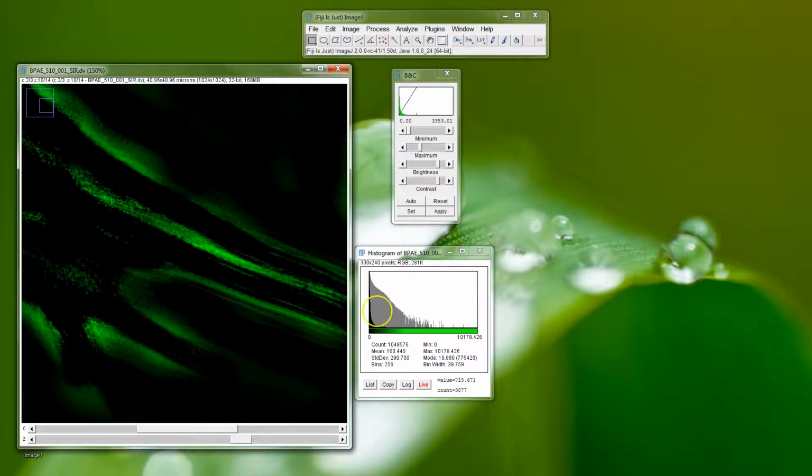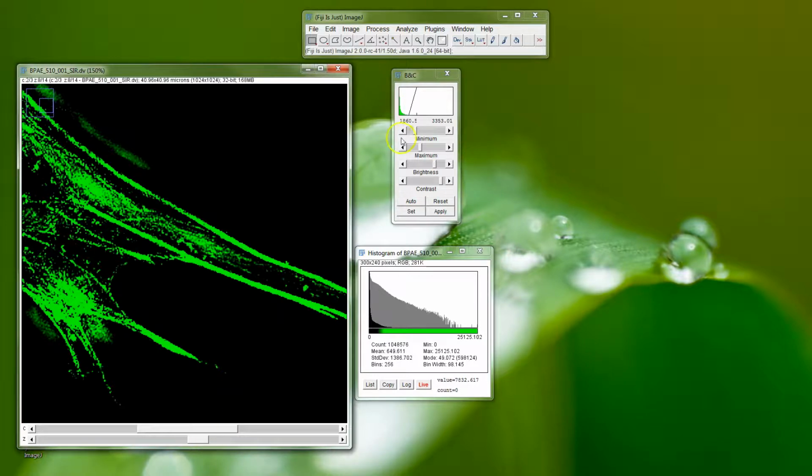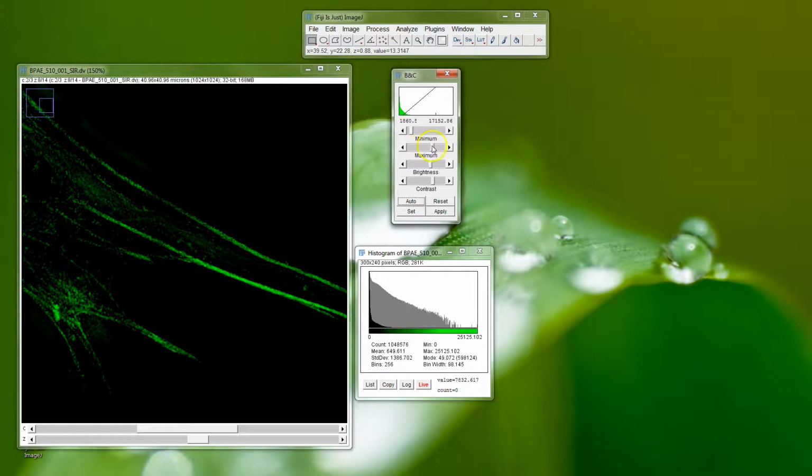So looking at a histogram there, a good part of this particular image is going to be non-real, the artifacts we don't want. So if we grab our contrast, we can move that up to a point where it starts to back out there, and then when we come up to the image we want at the better layout, we can then change the other end. We can maybe see a small amount here on this screen here.